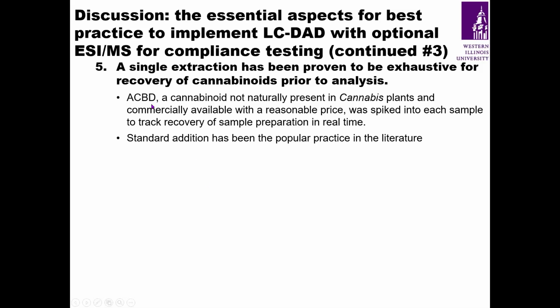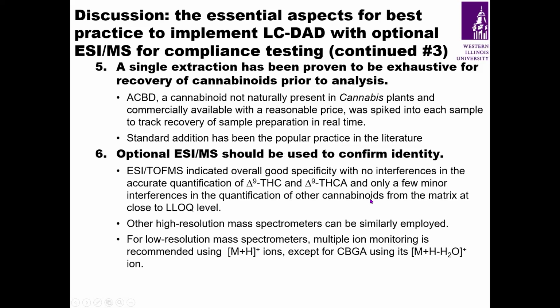In our studies, ACBD, a cannabinoid not naturally present in cannabis plants and commercially available at a reasonable price, was spiked into each sample to track recovery of sample preparation in real time. In the literature, standard addition has been the popular practice. Optional ESI-MS should be used to confirm identity.